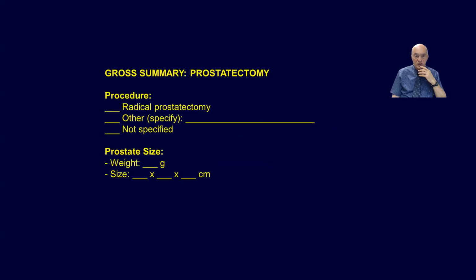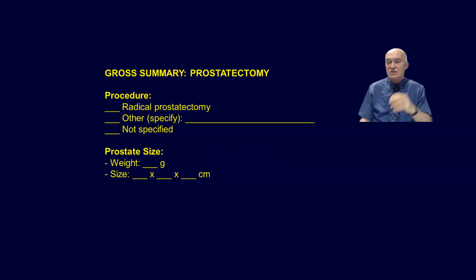And finally, we have the gross examination of the prostate. In this case, the prostatectomy specimens are usually not taken to the residents, and we have a special laboratory for specimens like prostate, because our laboratory is a center for research, national and international research in prostate cancer. So we have a special procedure that I'm going to illustrate later on with this video.